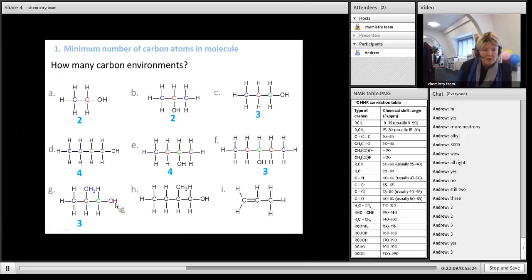So both carbons here are the same distance away from that OH. And they both attach to 3 hydrogens and a hydroxyethyl group where the OH is furthest away from them. So can you see that those 2 blues are actually identical?